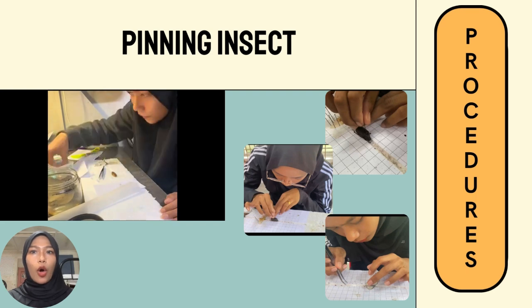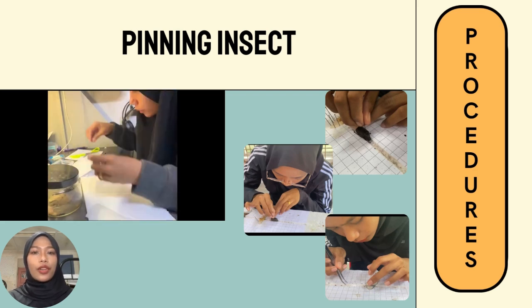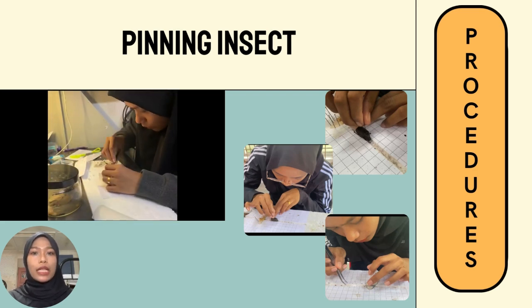After completing all the pinning on the insects that have been caught, all insects will be dried in the sun so that they are dry and easy to be placed in the display box.